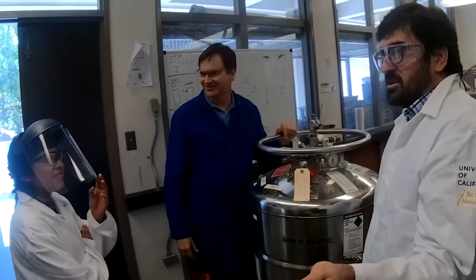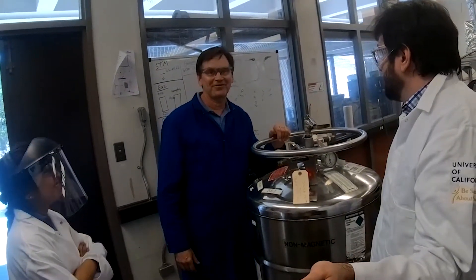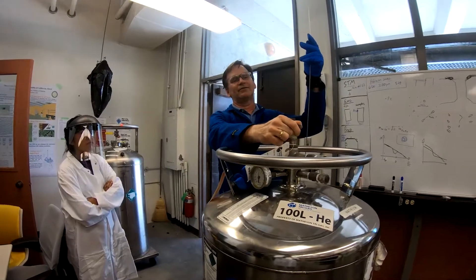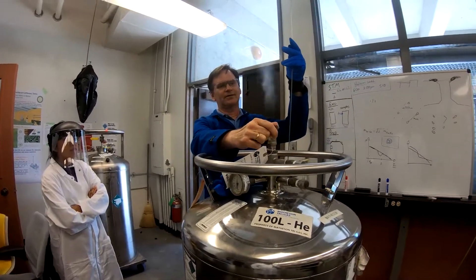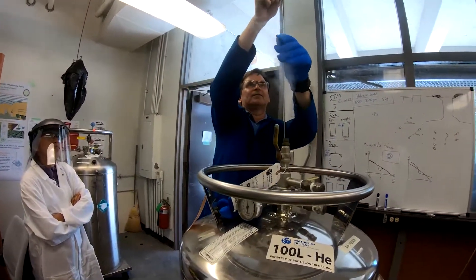Last time, that dewar was actually empty. We're going to try a full dewar. We're going to slowly open the valve and depressurize the dewar.